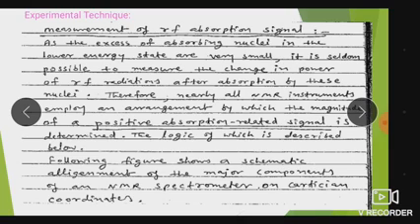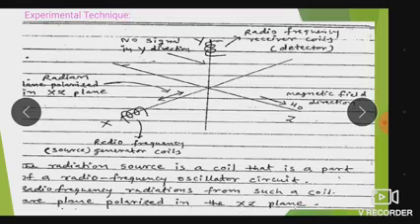The following figure shows the schematic alignment of the major components of the NMR spectrometer on Cartesian coordinates, showing how the sample orients with respect to the coils. See here, the radio frequency source generator coils, and at perpendicular position the radio frequency receiver coils. The radiation is plane polarized in the xz plane, and here is the direction of the magnetic field. So there is no signal in the y direction, only in the x and z directions.